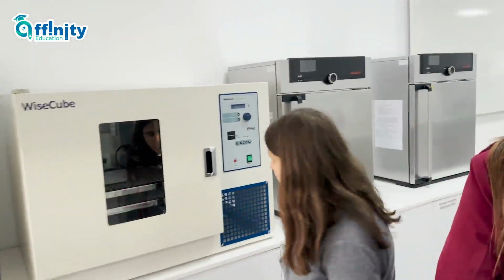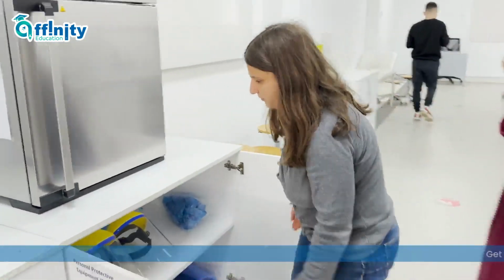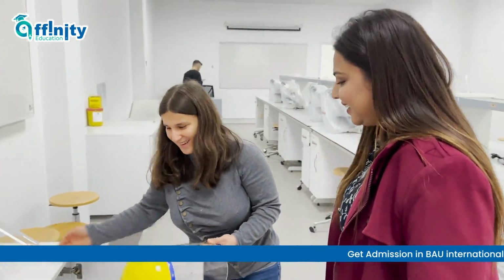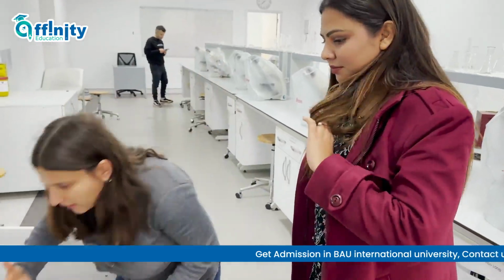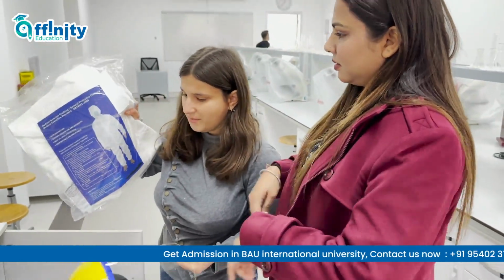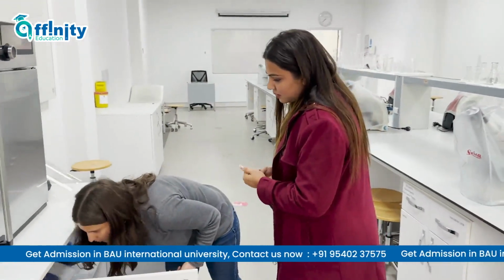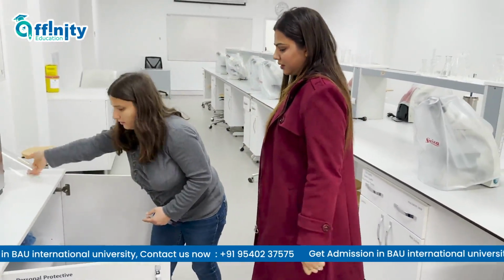Here we have kits. Here we have personal protective equipment for students. Yes, we all remember Corona time. And especially for this, there are more special clothes to protect themselves. They are special, you see. We just teach them how to wear everything correctly. So you have the proper kit. Yes, to teach them how to work in dangerous laboratories. Okay. That's good.